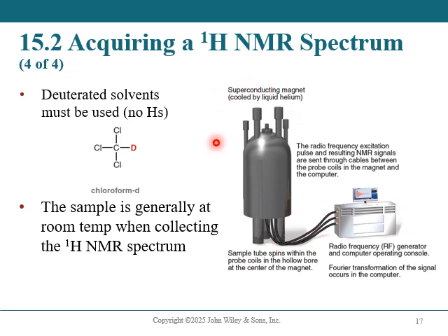This is what your typical NMR is going to look like. You have the instrument here, all your superconducting magnets. It's actually pretty large. I'm not sure the image does justice to it. This is like 6-7 feet tall. And the signals go here to the computer. This is what you analyze. This is where you put in the sample, right here in the center.